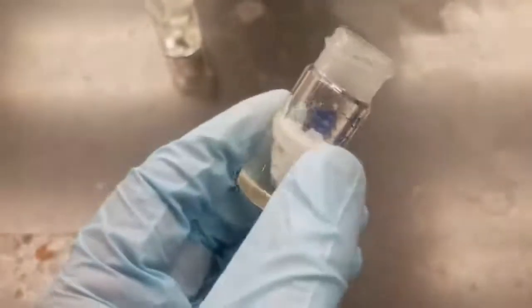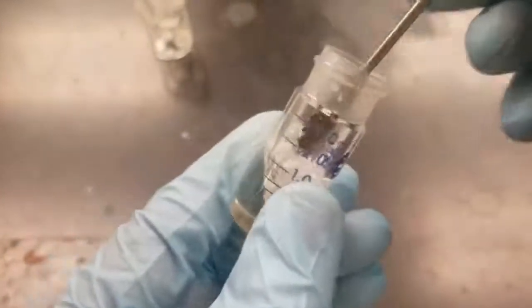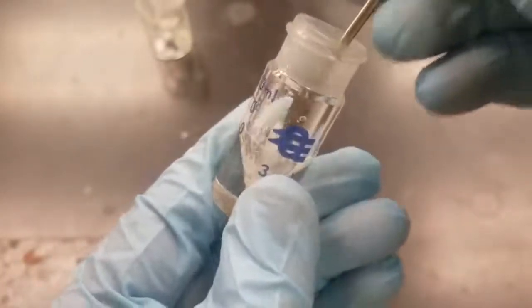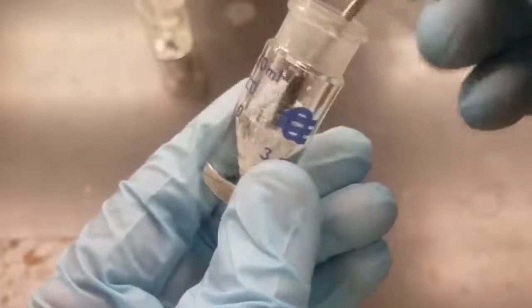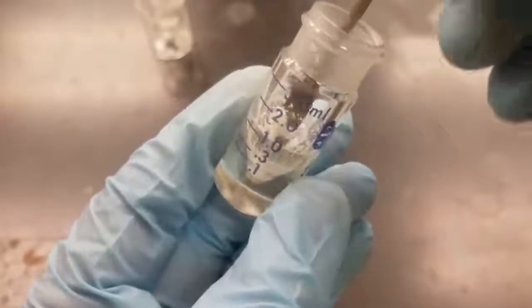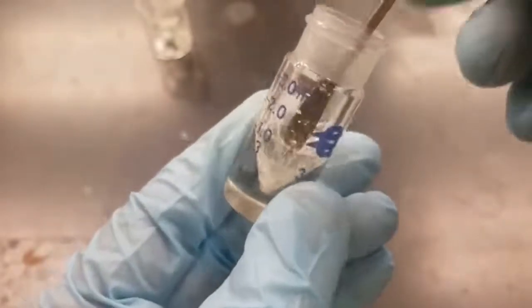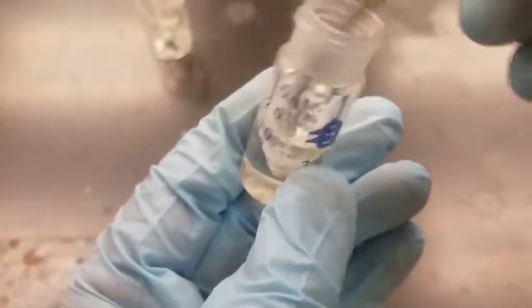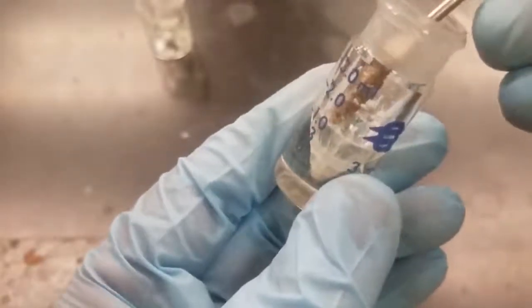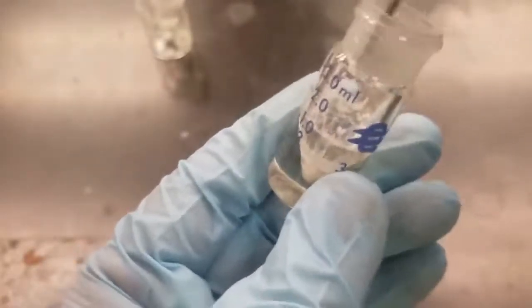All right, so you can see we have our white solid here. We'll take our micro spatula and just break up this solid. Push it generally towards the bottom. And then we'll put it back under the nitrogen stream and then reweigh it and repeat this process until our weight is no longer changing, which is indicating that our compound is nice and dry.